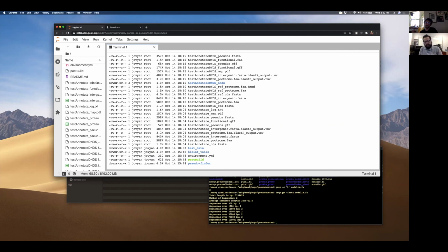So like everything else, this sounds like trial and error, right? Perhaps there are a lot of close relatives, but choosing one versus the other, like you said, implies differences in divergence time, and that will affect your results. But choosing a bunch of them could show how much of a factor that plays in your results. Okay. You can rerun the DNDS module by itself.